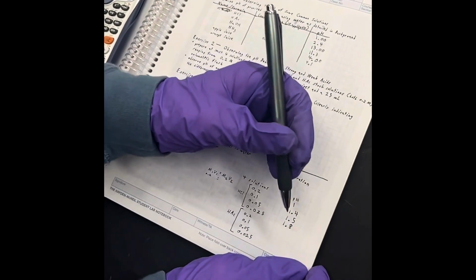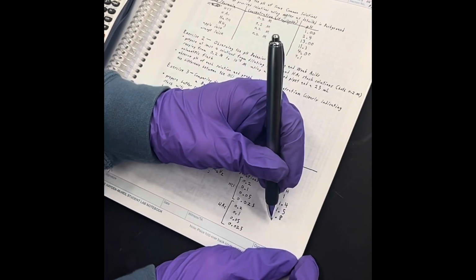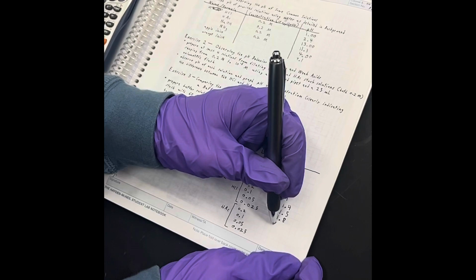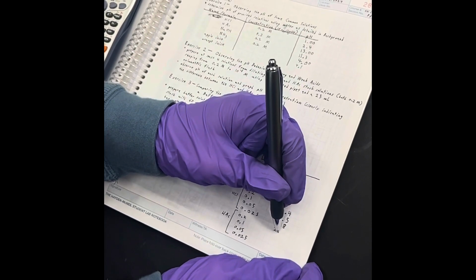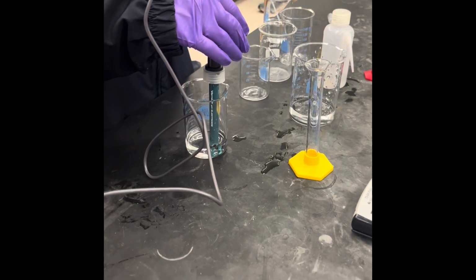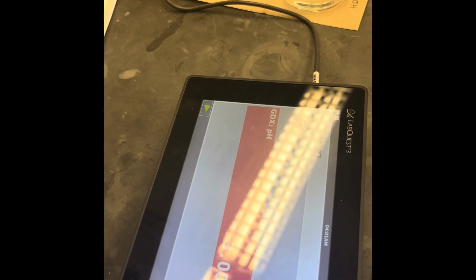Here we are working and filling out our pH data and starting a pH versus concentration graph. The graph here is to indicate the difference between hydrochloric acid and acetic acid. We came to the conclusion that the stronger acid was hydrochloric acid. It dissociated faster in water than the acetic acid. However, our graphs ended up looking very similar.